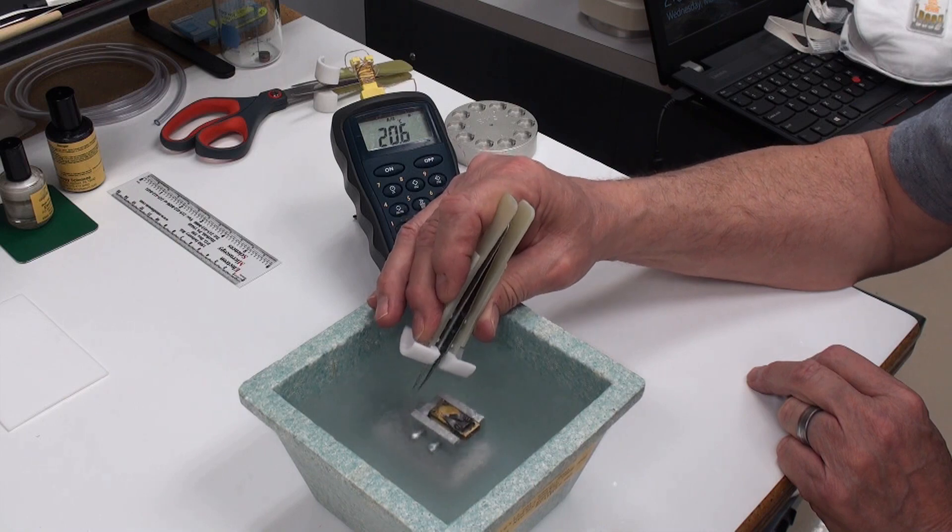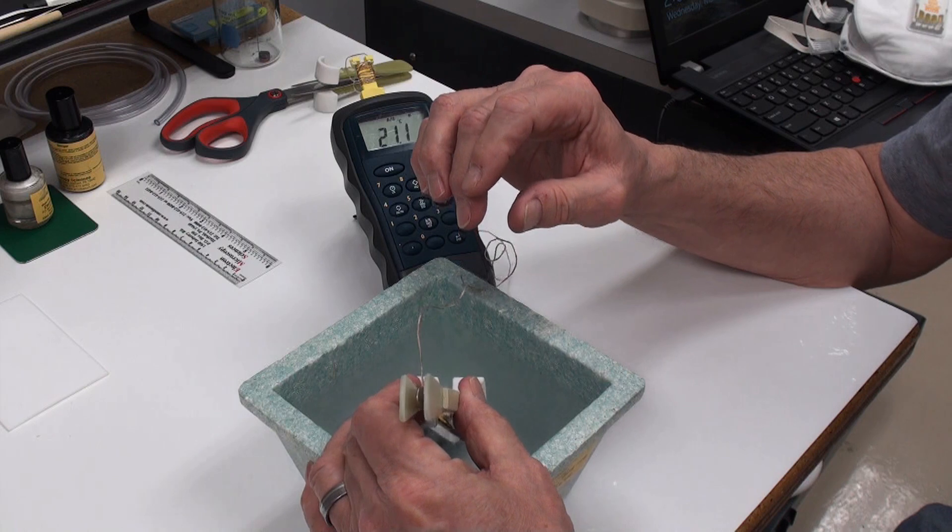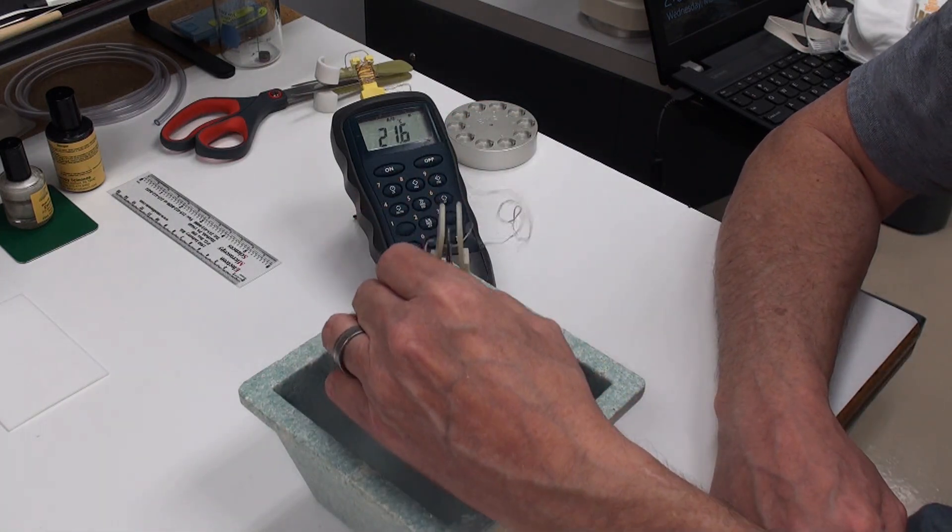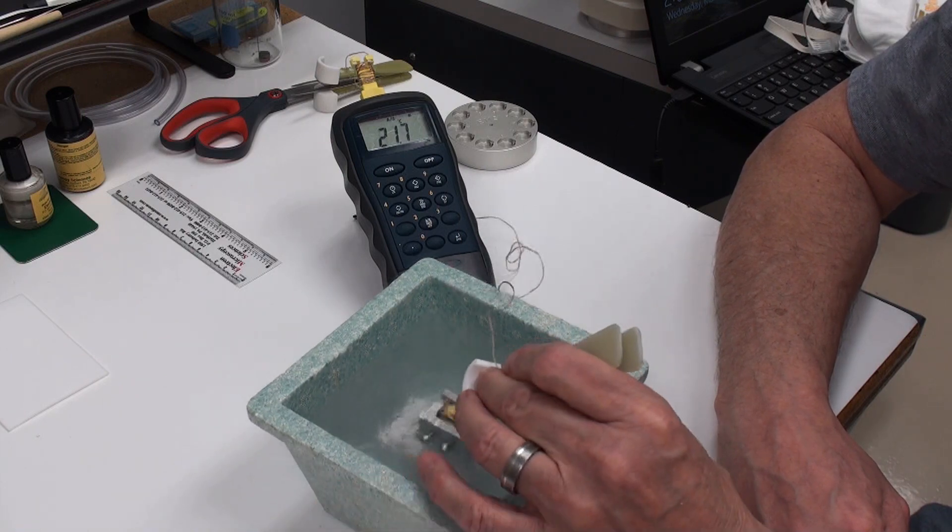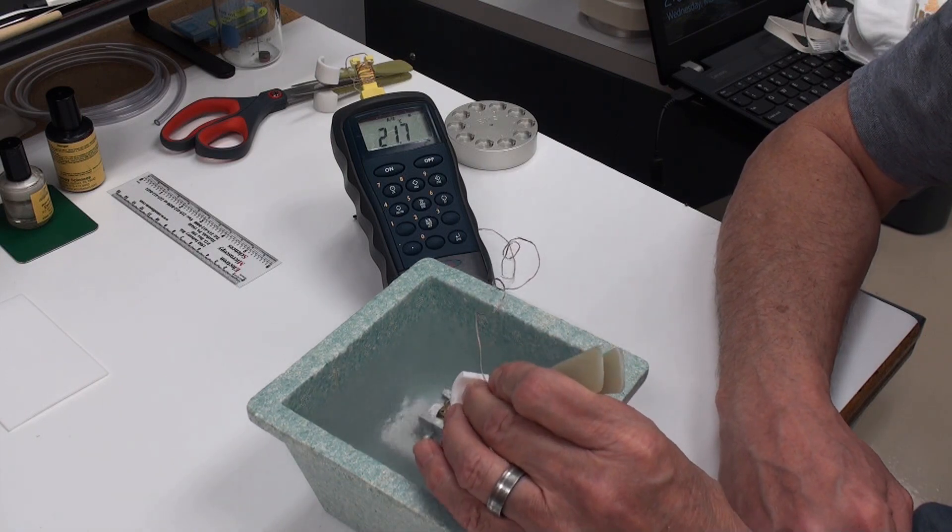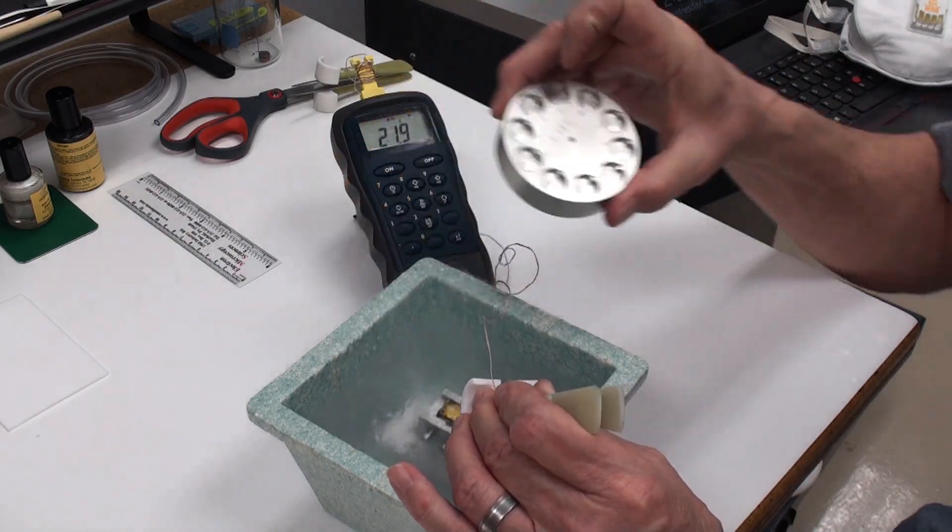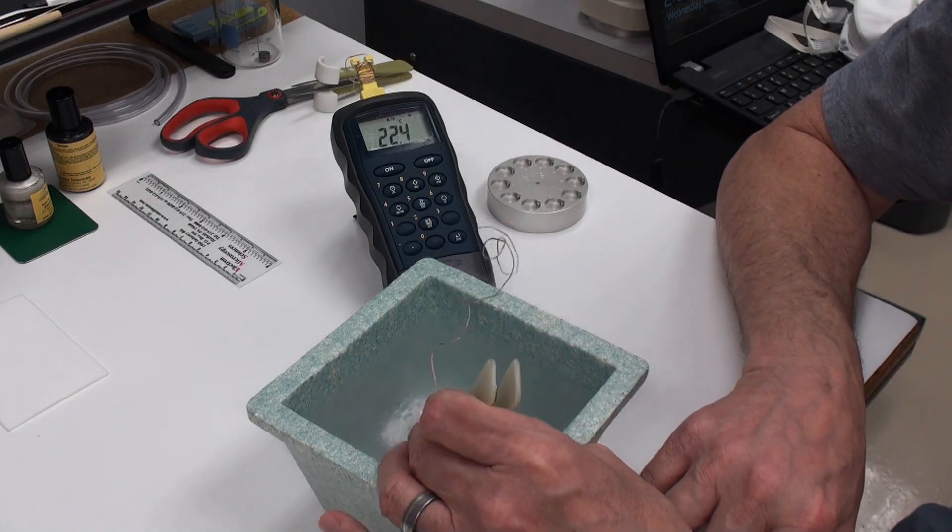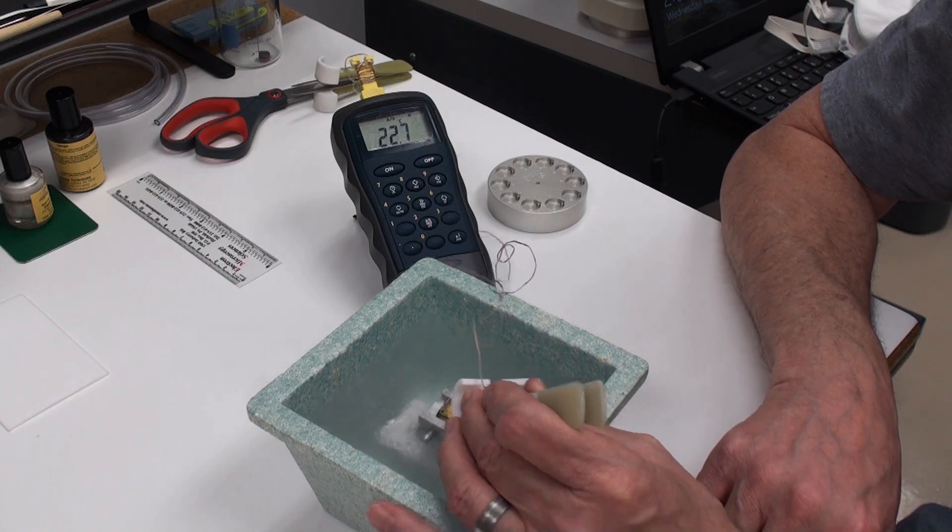So you can work in the nitrogen for quite an extended period of time and of course you can't immerse the whole thing in there. But certainly if you're manipulating grids that are going to go into a cryopuck or one of those capsules and you have a shallow enough dish, this will all work quite well.